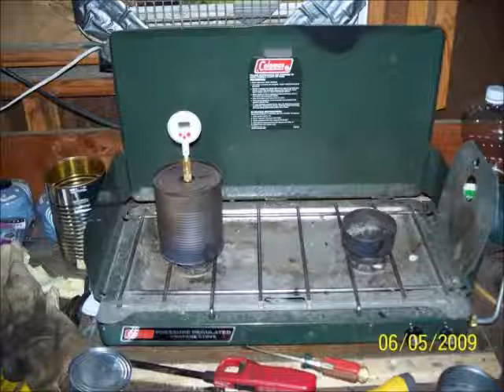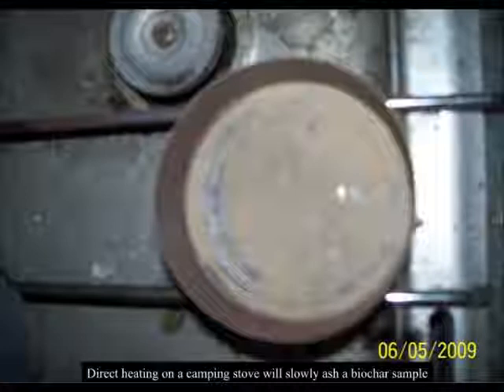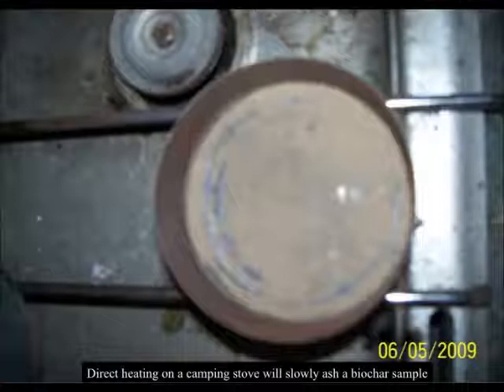On the right, I'm doing an ashing test. It's literally a tuna fish can. I lay a quarter of an inch down the bottom. I heat it from the bottom, let the air get to the top, make sure I'm not blowing out a lot of mass, and cook it out. At the end of the day, sorry about the focus, but you burn it down to that dull gray material, and you cool it down and weigh it back again, and you're going to get two significant figures. You're going to know your ash constituent to the nearest percent. And you're looking at whether it's 4%, or 15%, or 50%.